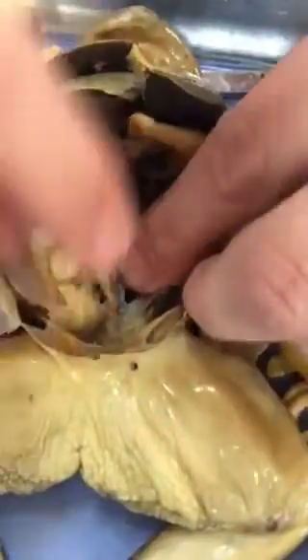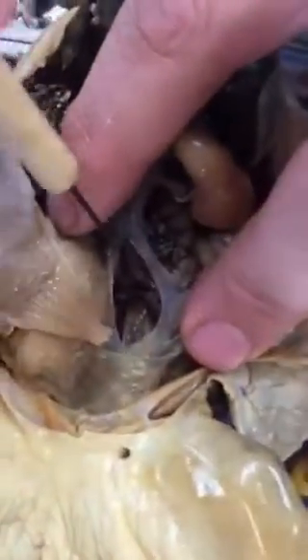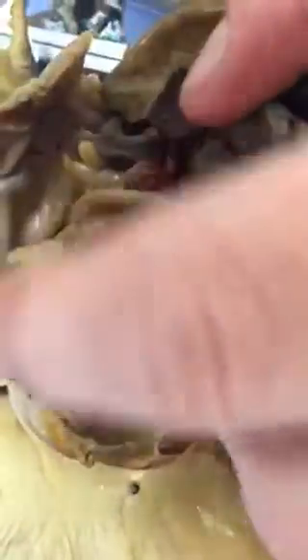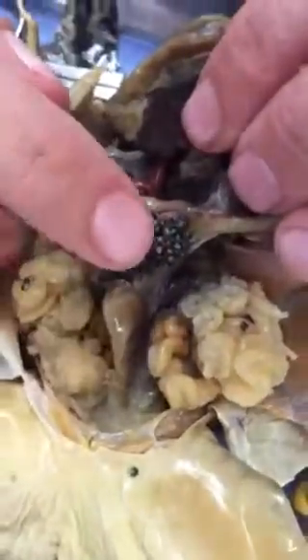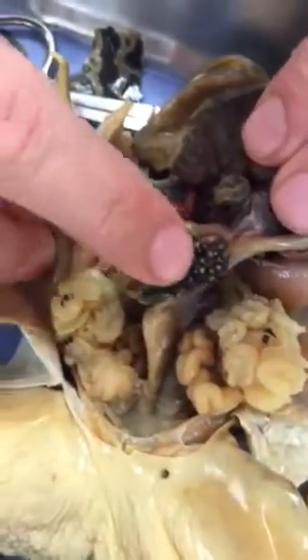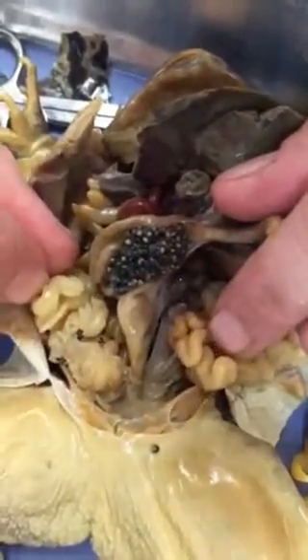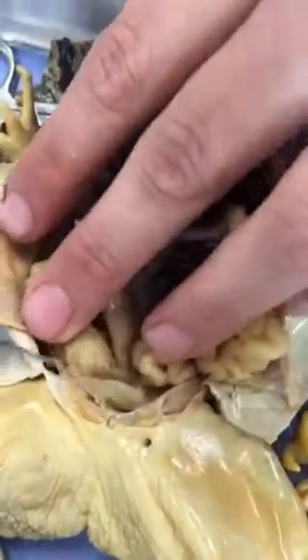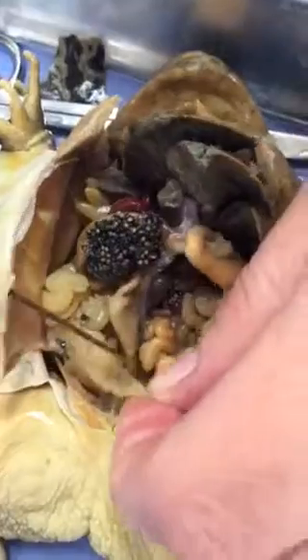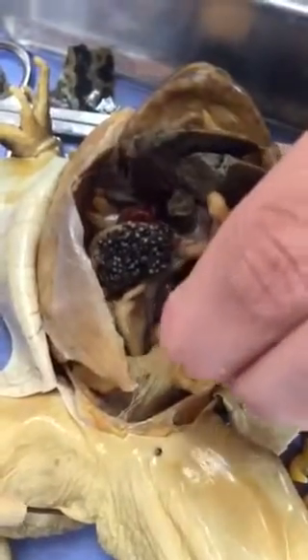As far as other things in here, underneath, open this up, this structure right here is the kidney. This is a female, and so this is the ovary. The ovary has eggs in it. Don't put eggs because that would be incorrect. So this is the ovary. It would go into these structures down here, which are the oviducts. Also down here we have the bladder. And then of course all that would exit through the cloacal opening.